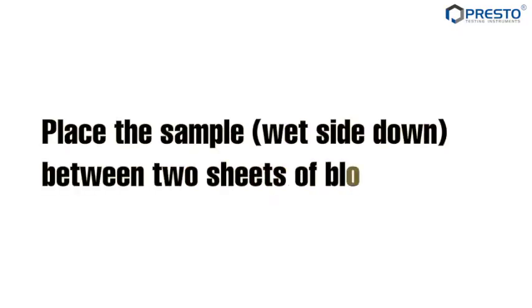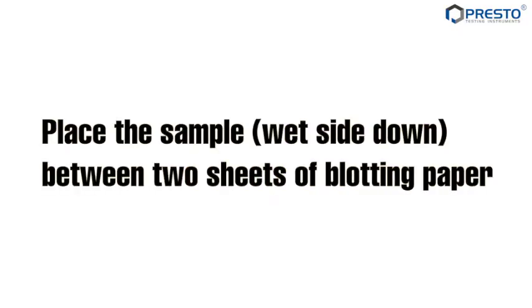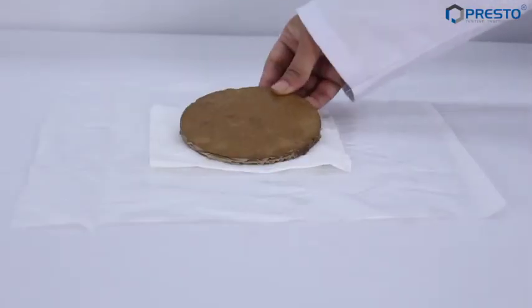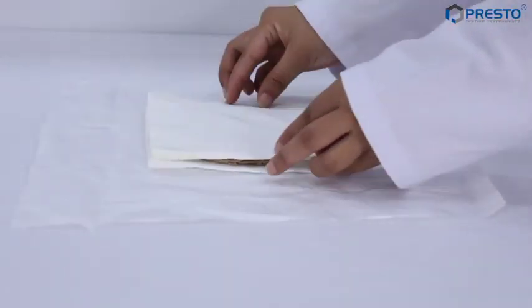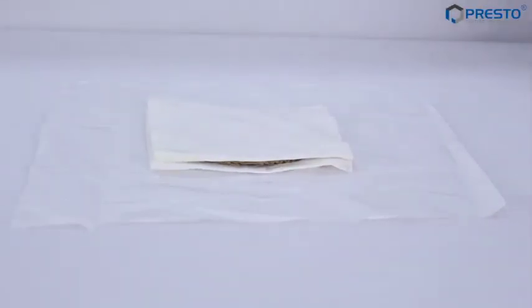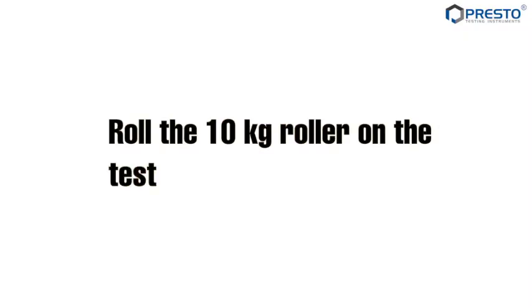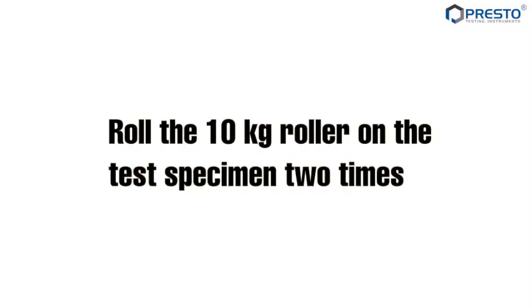Place the sample, wet side down, between two sheets of blotting paper. Roll the 10 kg roller on the test specimen two times.